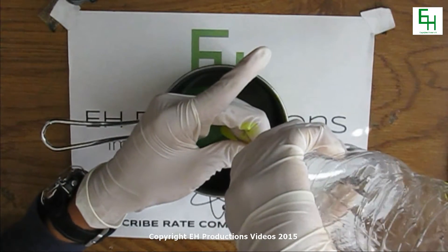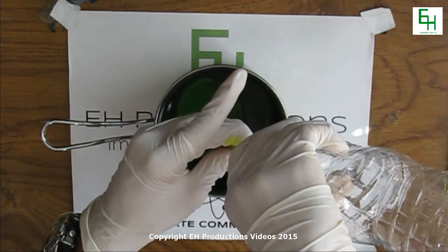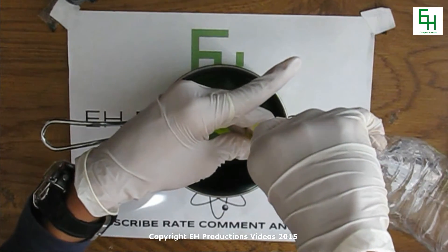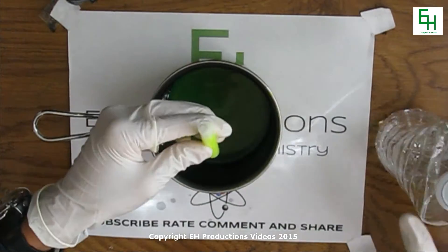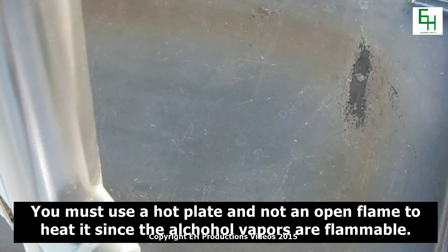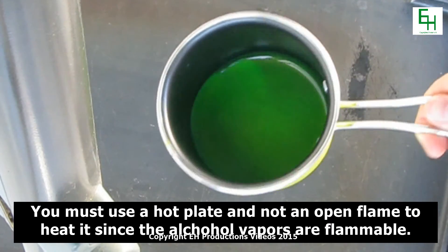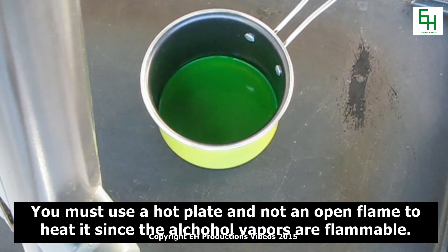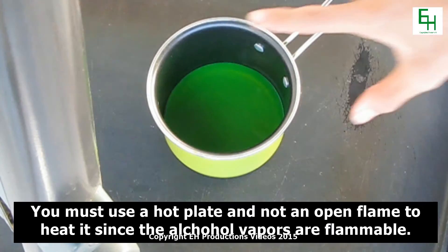Isopropanol alcohol is used for this because fluorescein is soluble in isopropanol. Just keep flushing this out. Over here I have a hot plate and I'm going to put our pot with the fluorescein and alcohol mixture here. What we're going to do is we're going to boil off as much of the alcohol as we can.